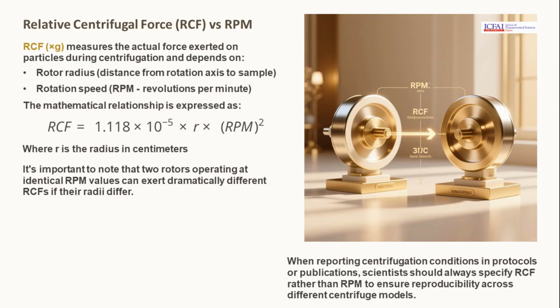Relative centrifugal force, RCF, measures the actual force exerted on particles during centrifugation, and depends on rotor radius and rotational speed. It's important to note that two rotors operating at identical RPM values can exert dramatically different RCFs if their radii differ. Specifying RCF ensures reproducibility across different centrifuge models.